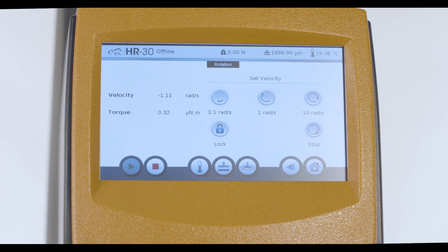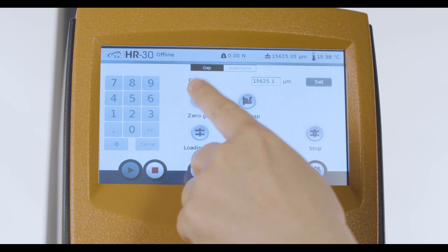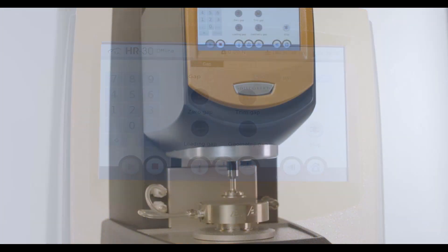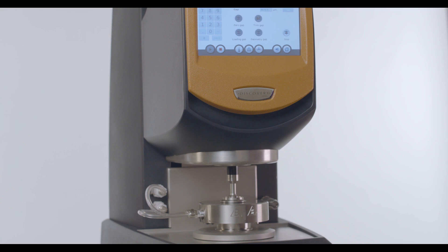From the instrument touch screen, press this button to access the geometry gap setting page. Zero the geometry gap at your measurement temperature. Then, go to the sample loading gap.